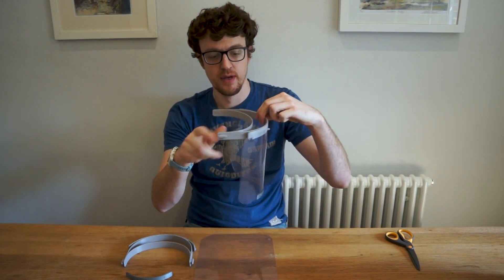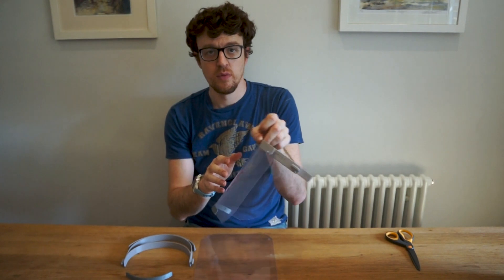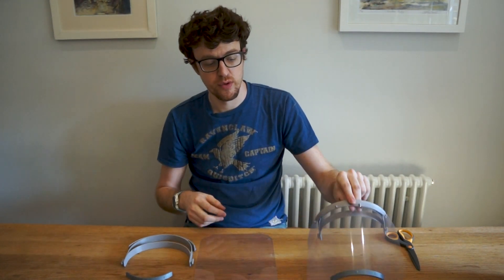Hi everyone, it's Aaron here from Pi Supply. I just wanted to do a quick video to show you how to assemble one of these. This is the Prusa version of the face shield. We've done another video which shows you how to assemble the Eye Maker version — very similar but it's just a slightly different design, so we thought we'd do another video for you.